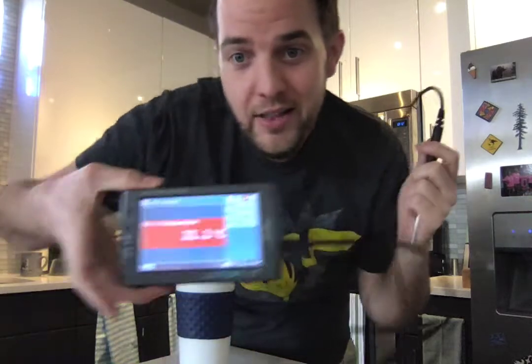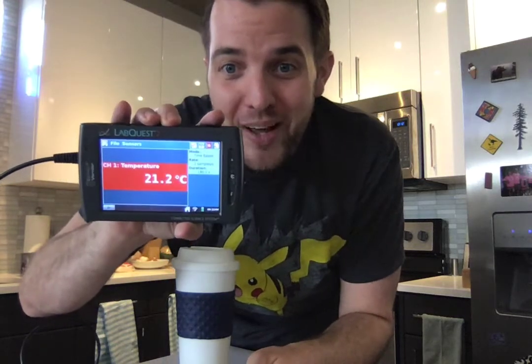I did bring home a temperature probe, a LabQuest from our classroom. It's upside down, but you get the idea. And then we are going to essentially just pretend as though we're doing the lab, and we're gonna record data as it is expected, and then go from there, okay?